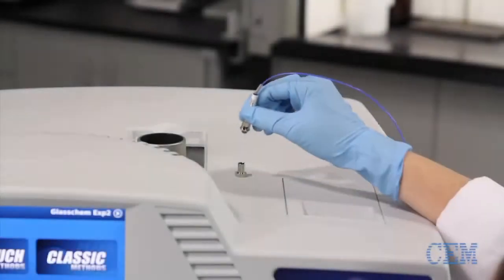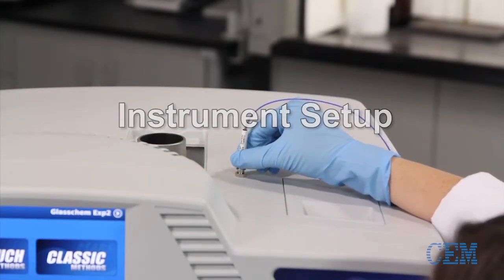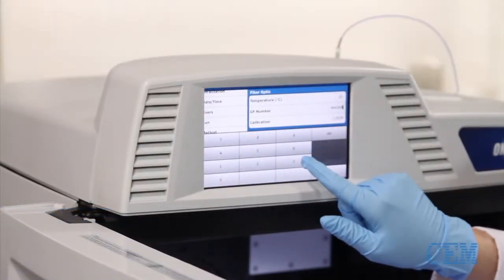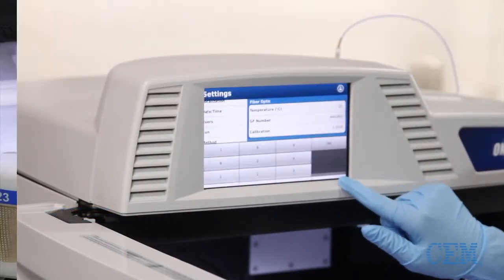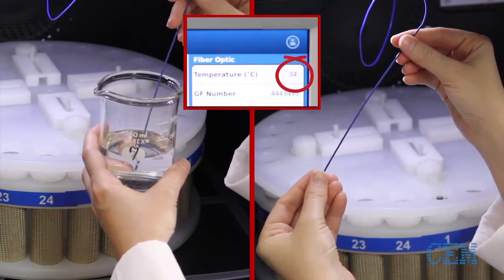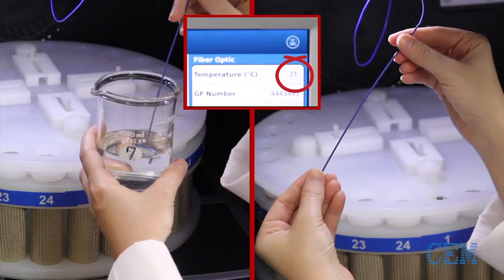To set up the MARS-6 for operation, connect the fiber optic probe and enter the correct GF number. Then, confirm that the probe is responding properly by warming it with your fingers or with warm water.